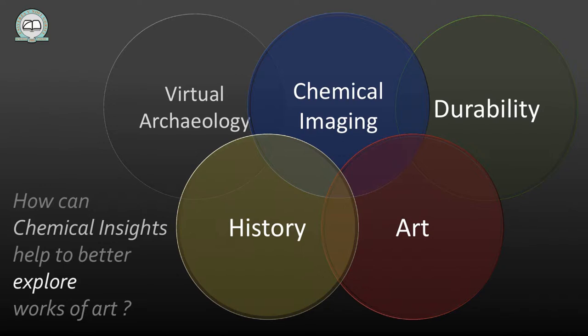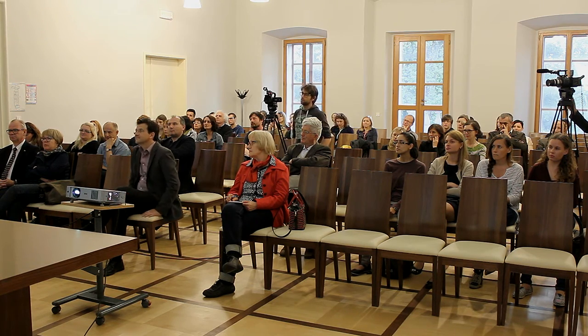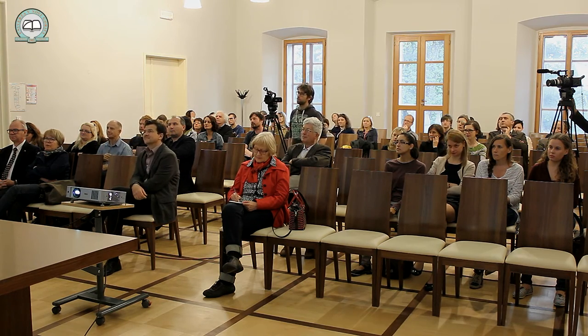And so historical data and historical information, which one can learn from art objects, is an interesting topic to pursue. And when we try to do that with chemical imaging, sometimes we have to not just look on the surface of the art objects, but we have to dig a little bit deeper below the surface. So what we're doing is we're digging inside, like archaeologists are digging, but we're not really digging, because art objects, especially old ones, are valuable and unique and precious and protected. So we dig into the surface, but in a virtual way. And with X-rays, we can do that relatively easily. And so we call this virtual archaeology we're doing on art objects.